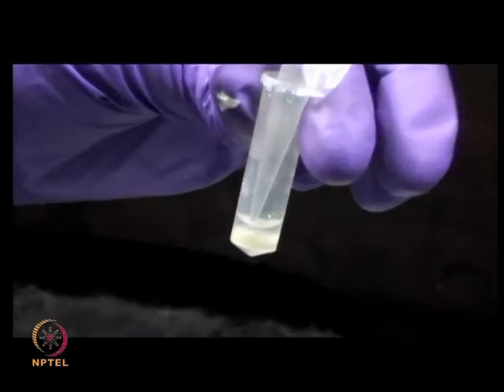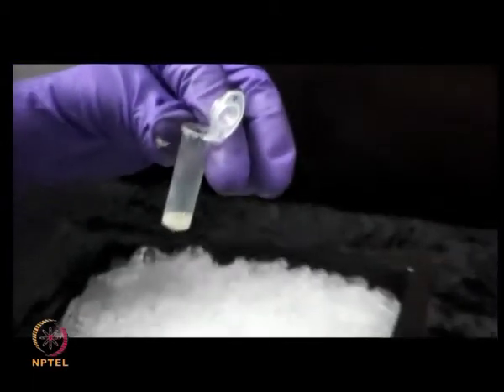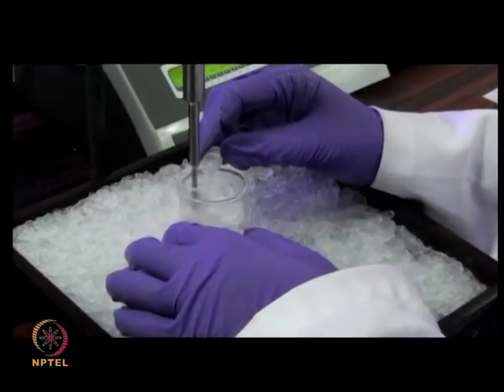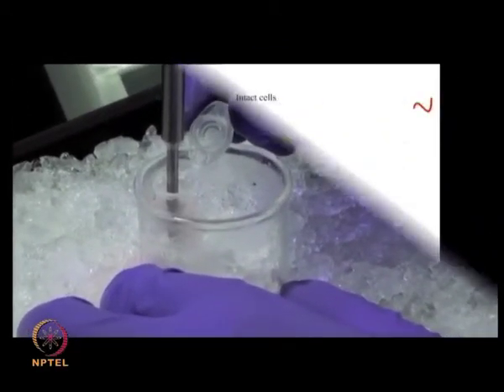Wash this pellet thoroughly with phosphate buffer to remove any unwanted debris. Sonication. The resuspended pellet is sonicated on ice to enable the bacterial cells to break open so that its contents are released.